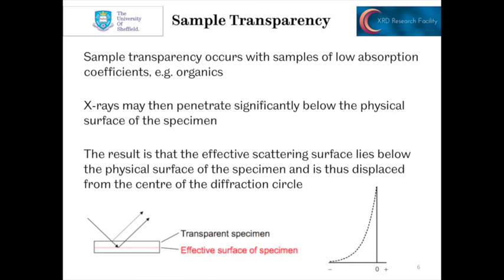Sample transparency occurs with samples where they've got a low absorption coefficient, particularly with X-ray diffraction. If the samples are organics or have lots of light elements, then this may be a problem. The X-rays, because the sample is not absorbing so heavily, can penetrate significantly below the actual physical surface of the specimen. The result is that the scattering surface effectively lies below the physical surface, and you can see that drawn in the schematic at the bottom.